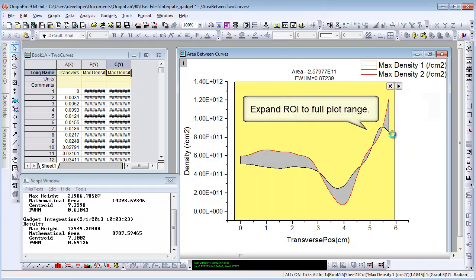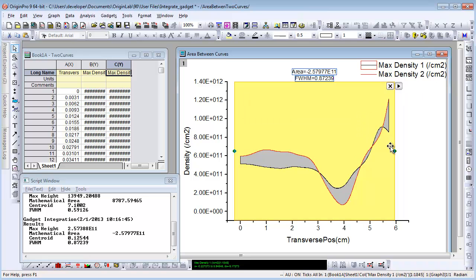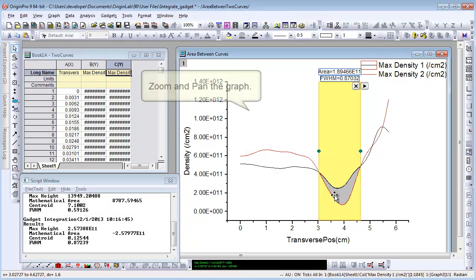You can choose Expand to Full Plots Range context menu to calculate the area between full range of two data plots. You can also resize the ROI box to be between two intersections.